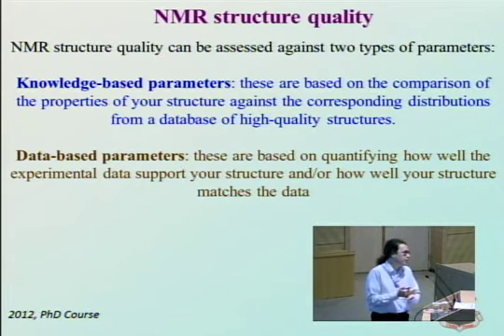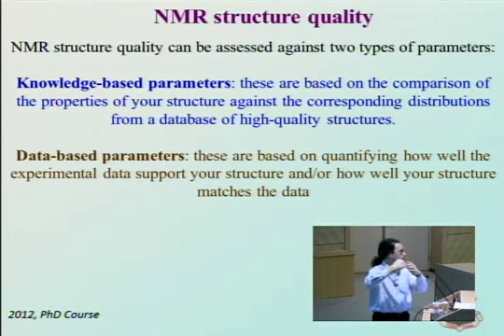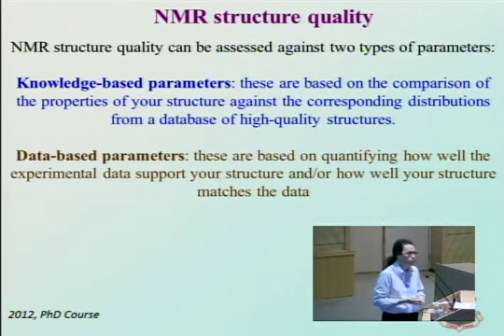So you see, for example, how many residues are in the allowed region of the Ramachandran plot in these structures. You make statistics, you have several structures, so you can compute the entire distribution. Then you calculate the distribution in your structure, and you say, is this the same distribution, or is it shifted, the average is not corresponding.